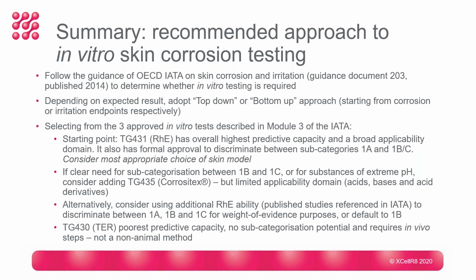More information is given about that in the IATA, or you could choose to default to 1B, which is looking at sort of worst case scenario. So it's exercising caution in terms of the labelling of that material.